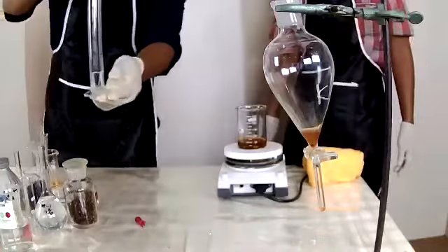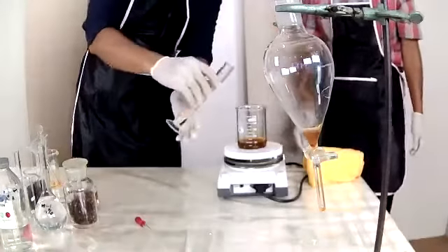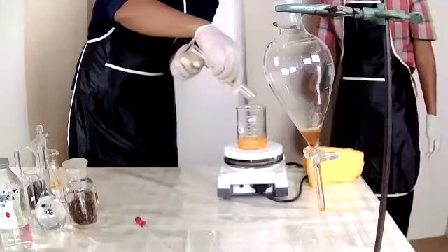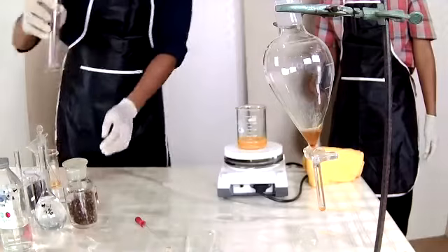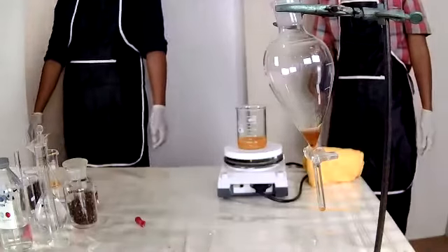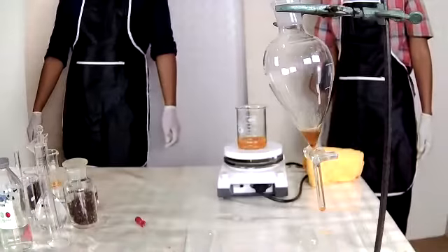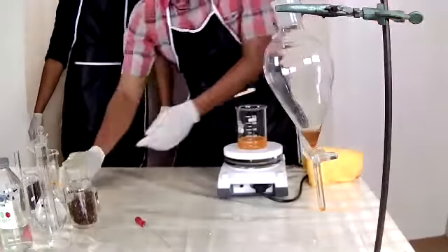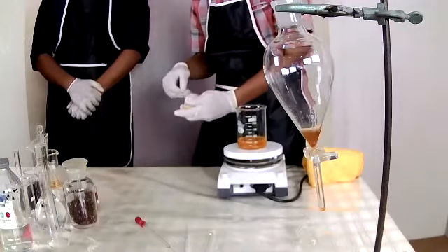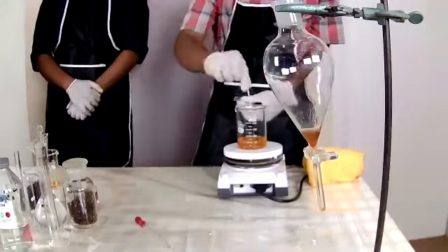So we're going to measure the pH. This is the hydrochloric acid, 6%. We'll check the pH level. And we're looking for a pH of 4 here.